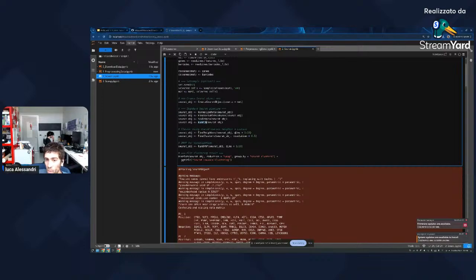And then here, we just tell how many dimensions we want to use. Usually there are also ways to visualize this data and see how data are changing according to how many dimensions we want to use. But you can start low with dimensions from 1 to 10, and then you can even modify this value and see how your results are going to change.